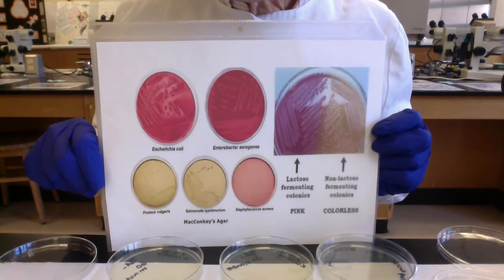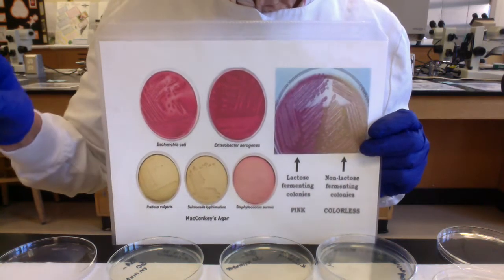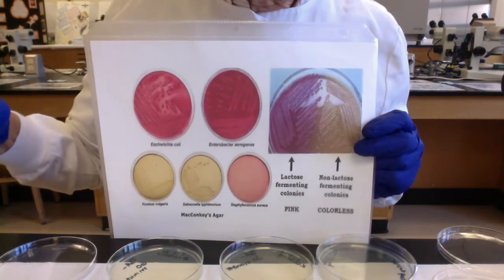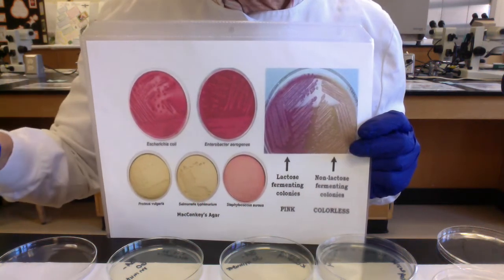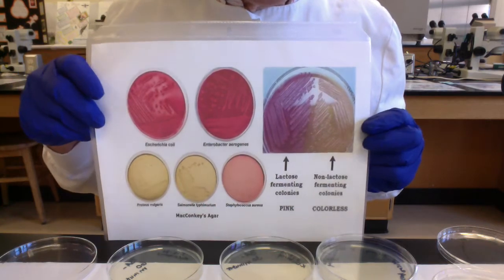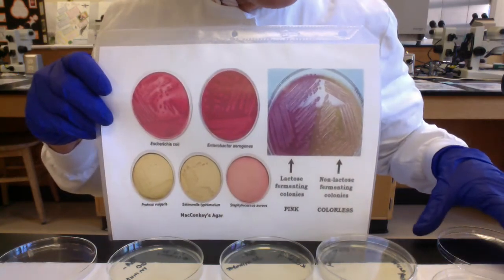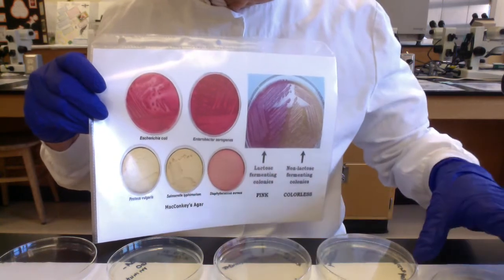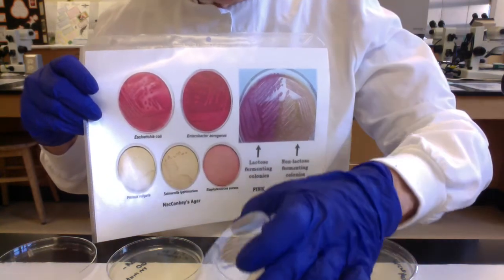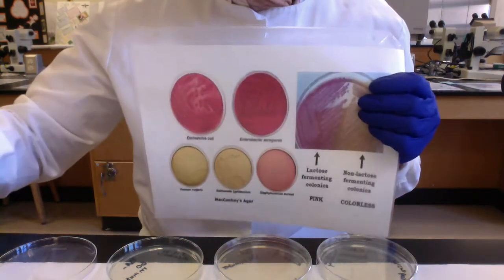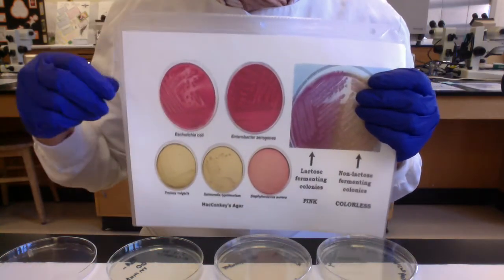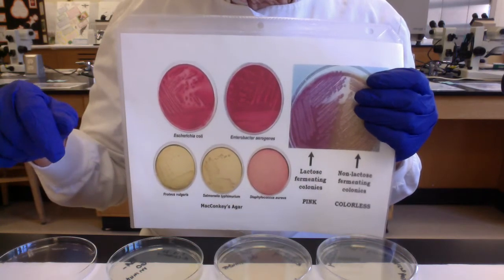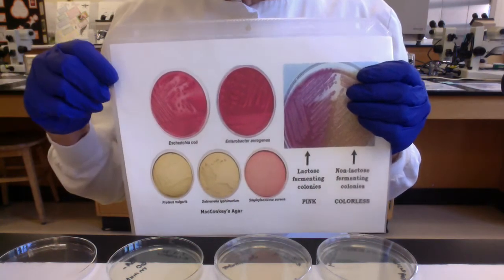So with those inhibitors on board — you might recall from a previous video, we're running our airborne microbe experiment. That was my 30-minute timer, so I'm going to put my plates on my 30-minute TSA plate and my 30-minute Sabouraud dextrose plate. I'm going to reset the timer for another 30 minutes so I can make sure I've exposed my 60-minute plates for a total of 60 minutes.